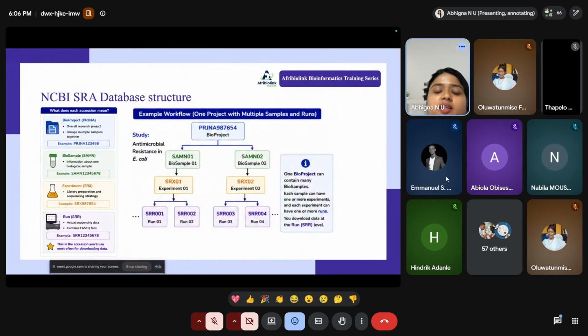For example, there is a gut microbiome project going on in China. If it is a wide level of data, the biosample comes to gut microbial data, maybe skin microbiome data, maybe anything.